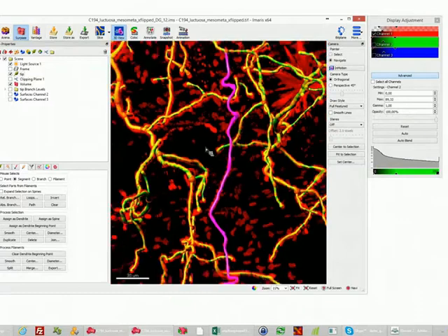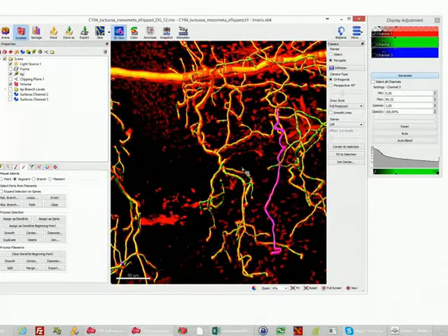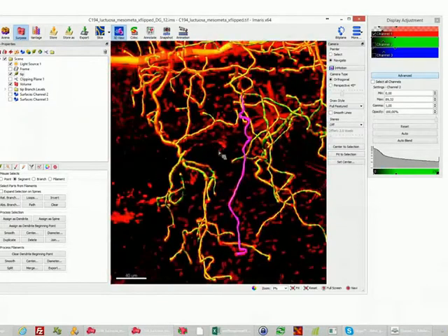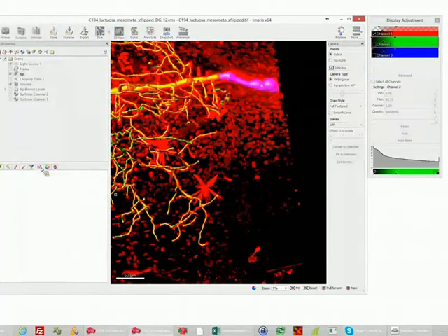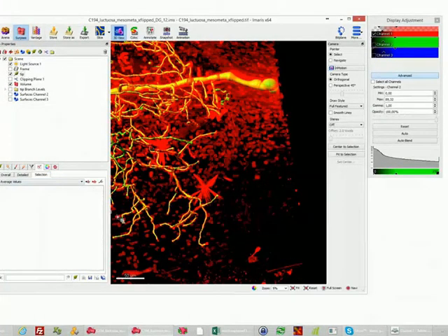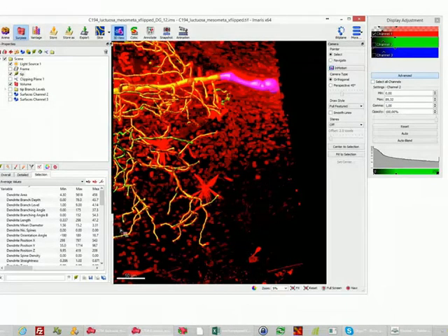Okay, so that's basically done. This is what I want to show you for the reconstruction part. The next thing is that you now have, of course, a lot of statistics. For instance, if I select this part and switch to the selection tool, you see that we get quite a long list of statistics.